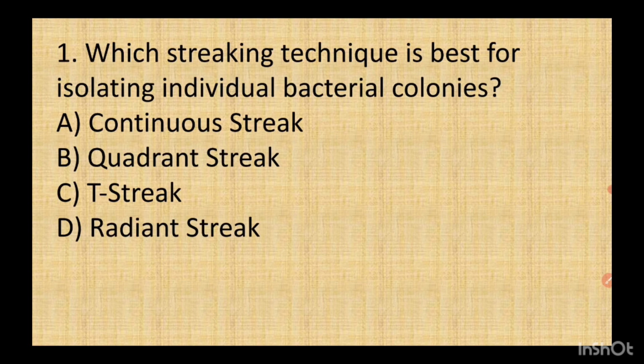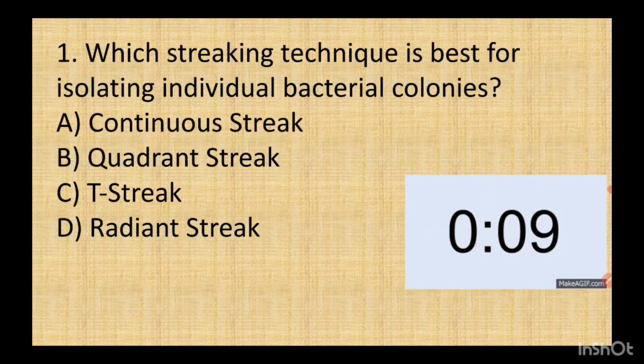Okay. So here are a few questions. Try to answer those. Which streaking technique is best for isolating individual bacterial colonies? Quadrant streaking.